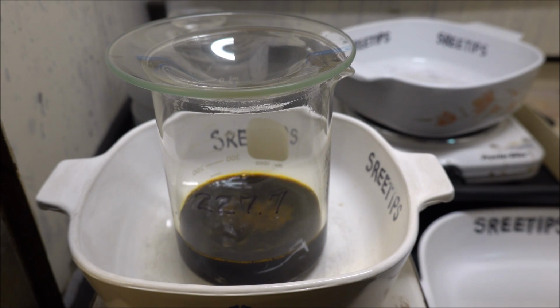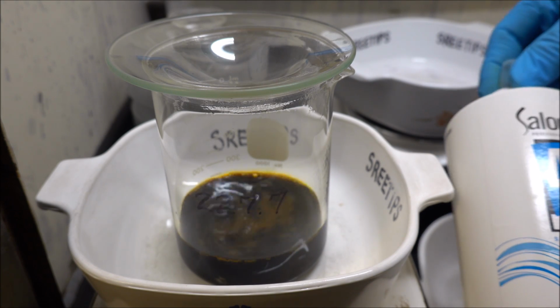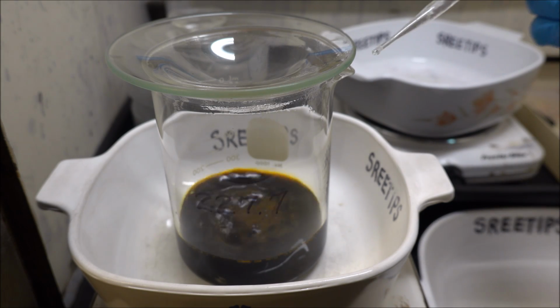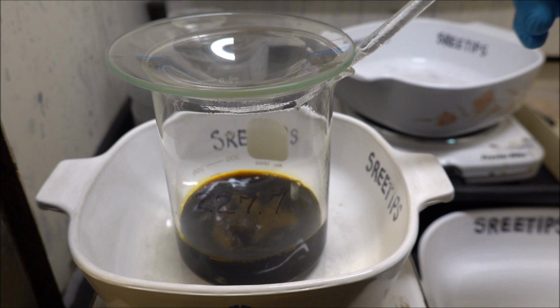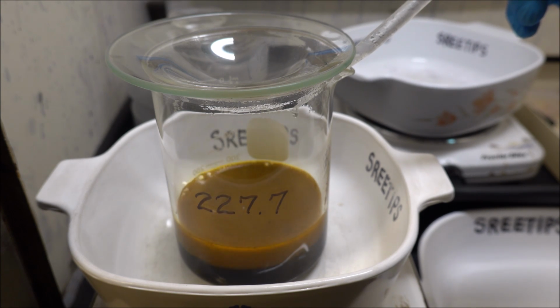The nice thing about dissolving the metals with hydrogen peroxide and hydrochloric acid is there will be no nitric acid involved here, so I won't have to worry about denoxing this solution before I go to the next step.